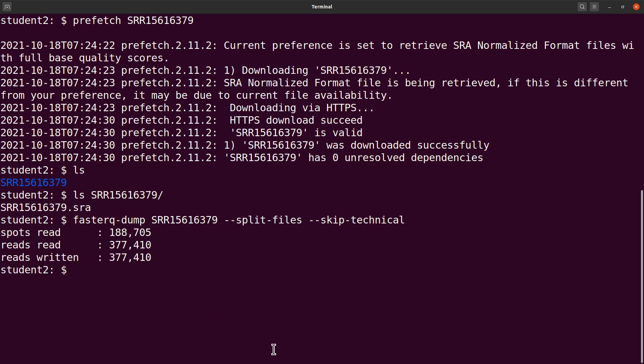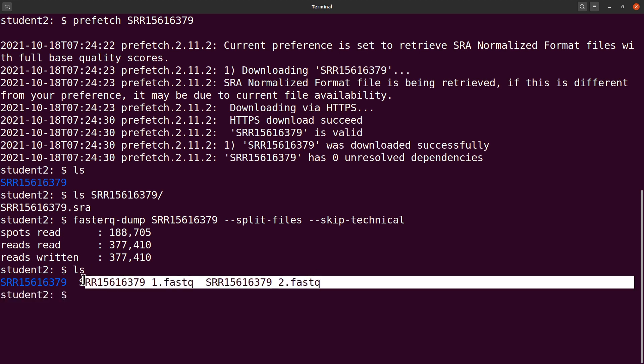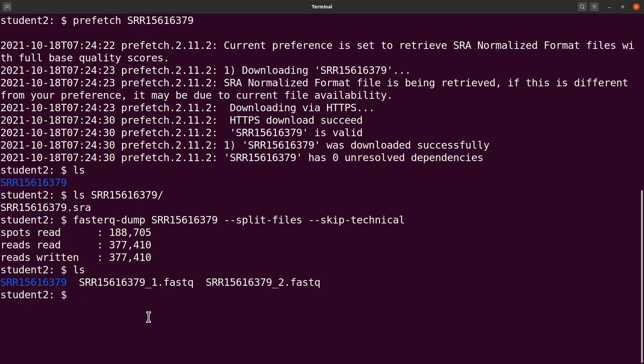So it's done. Do an ls and you'll find your reads there. You have read one, read two, that's the FASTQ files that we have extracted. So this is how we do it with paired-end if all your reads have mate pairs.